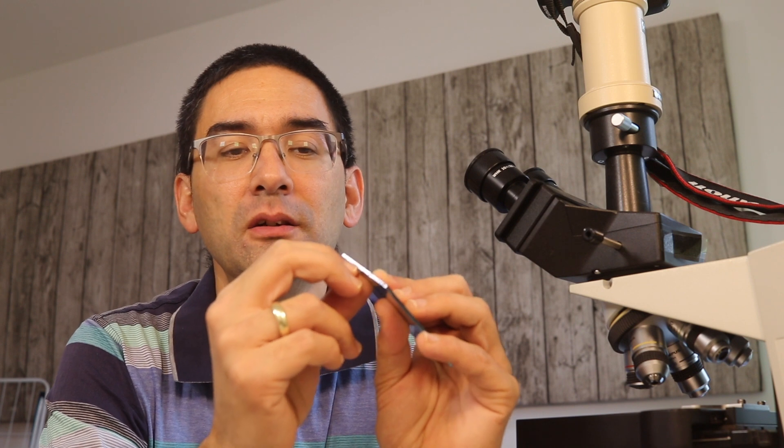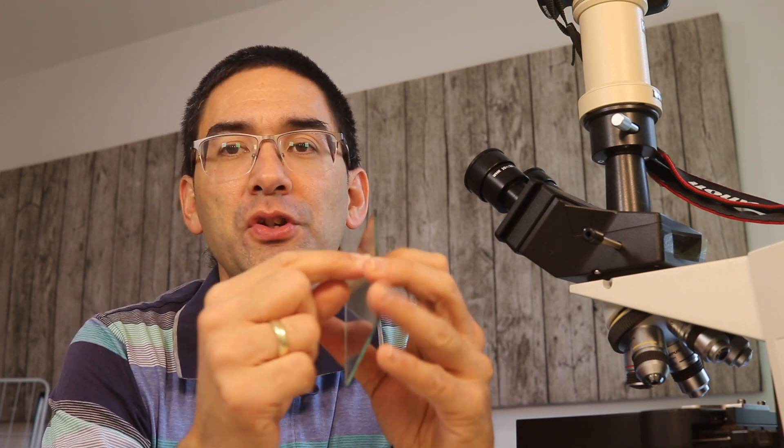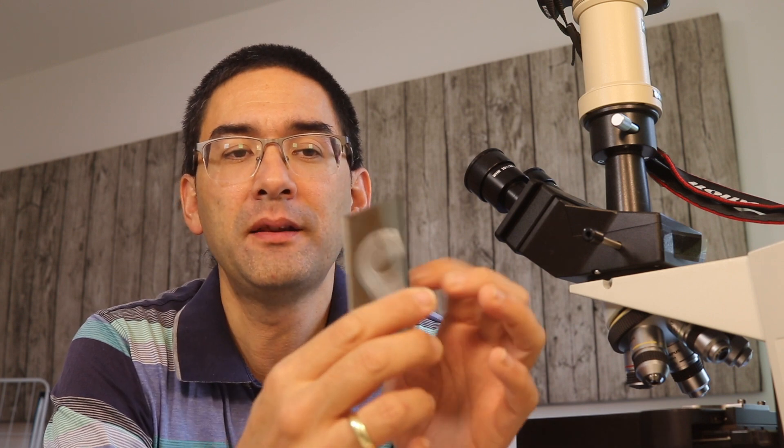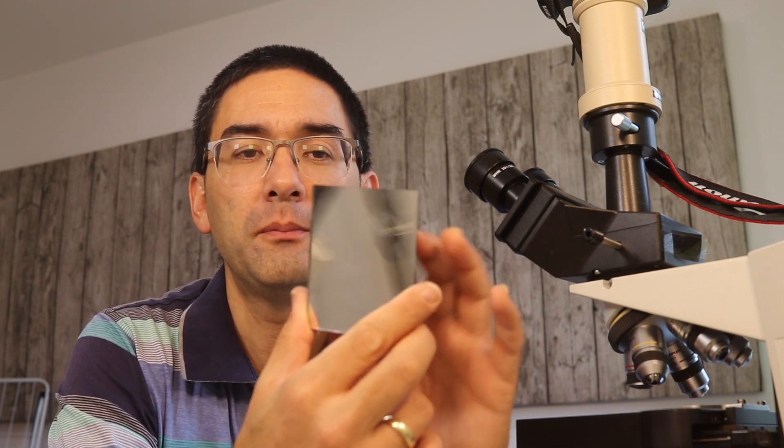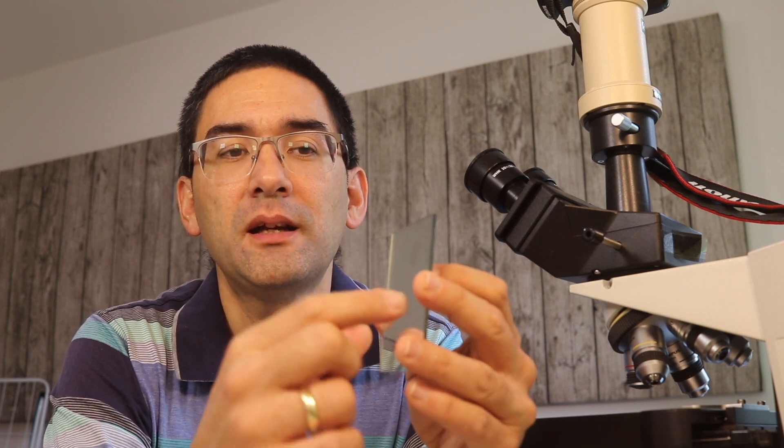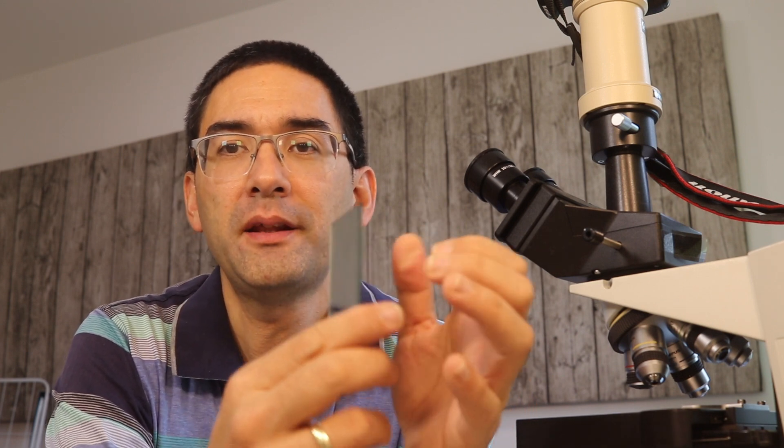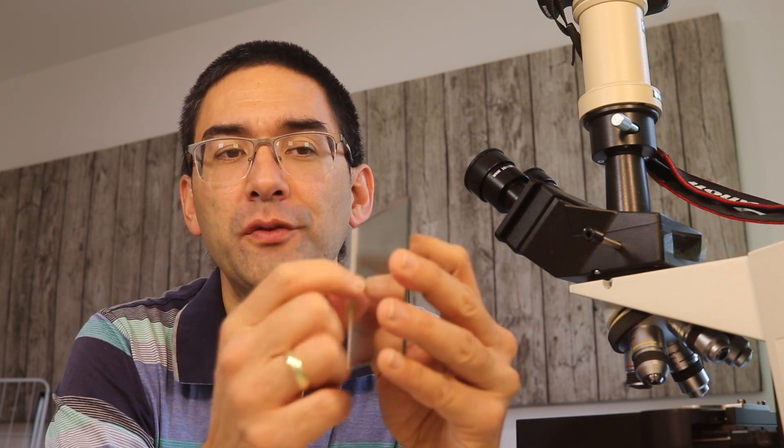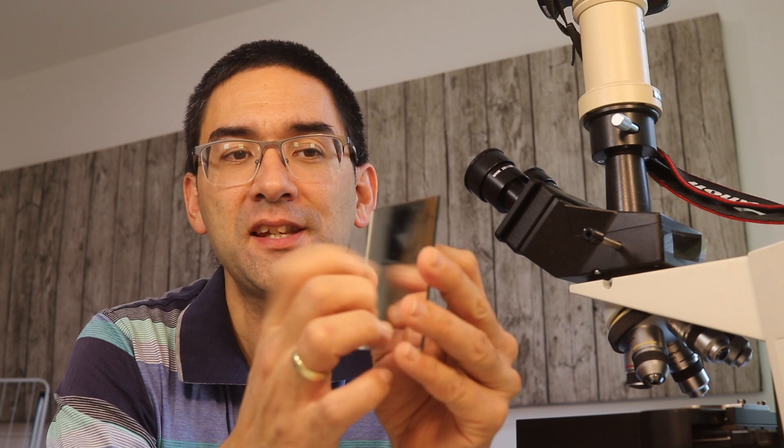But it's like this that there are some other problems with the mirrors that I just want to talk about. And one of these problems is that a mirror has a glass here, through which the light first has to pass through before it's reflected by the aluminum, which is on the back side here. And this means that there's light, which is reflected by the actual reflective surface, by the actual mirror surface, and the light, which is also reflected by the top surface of the glass here.